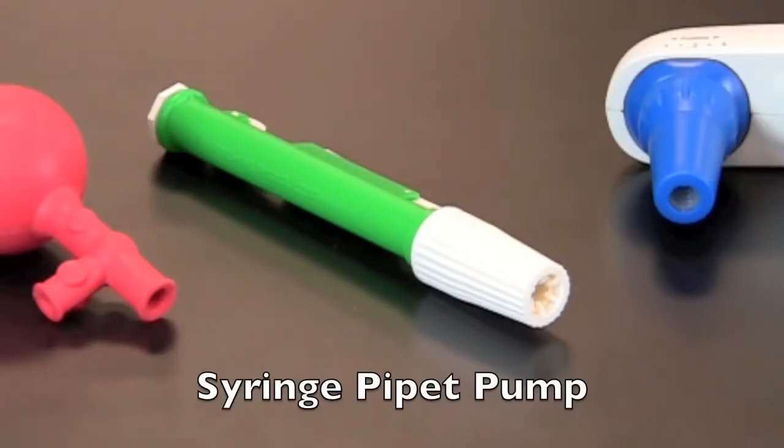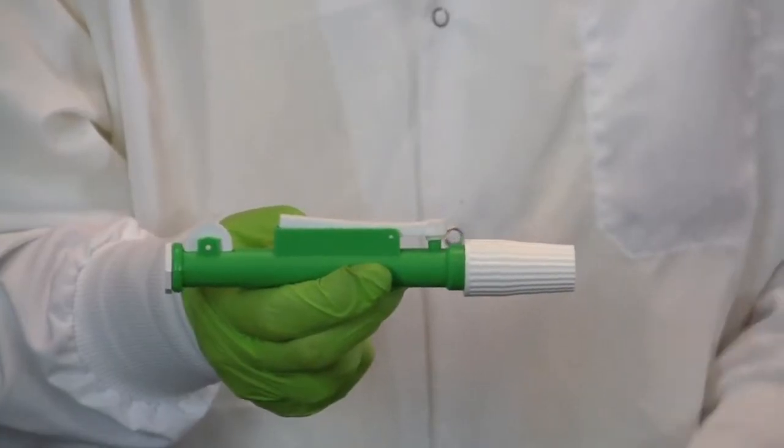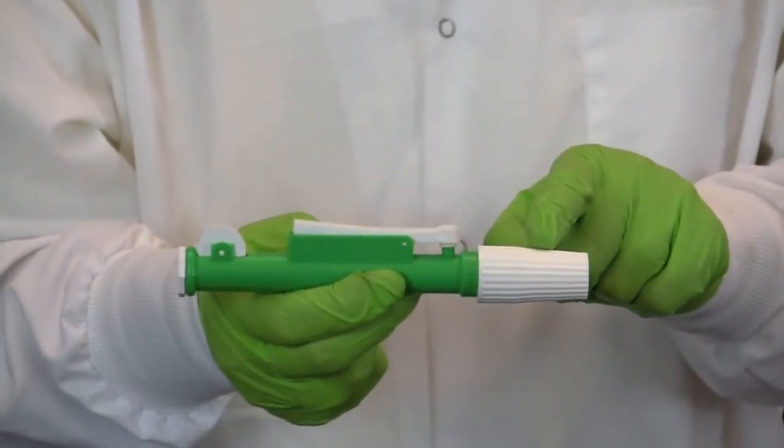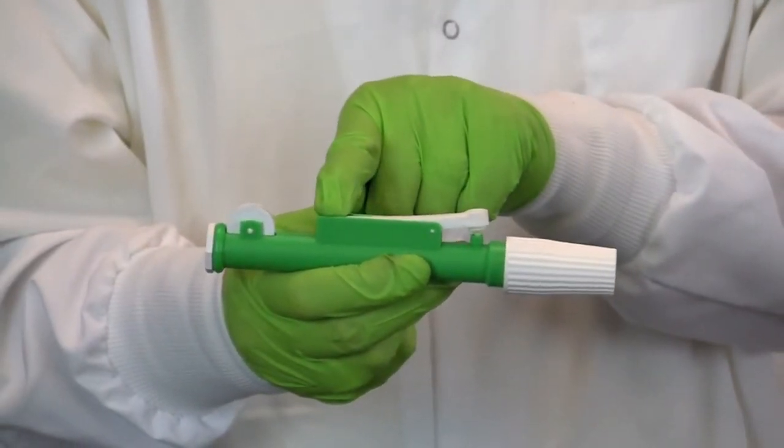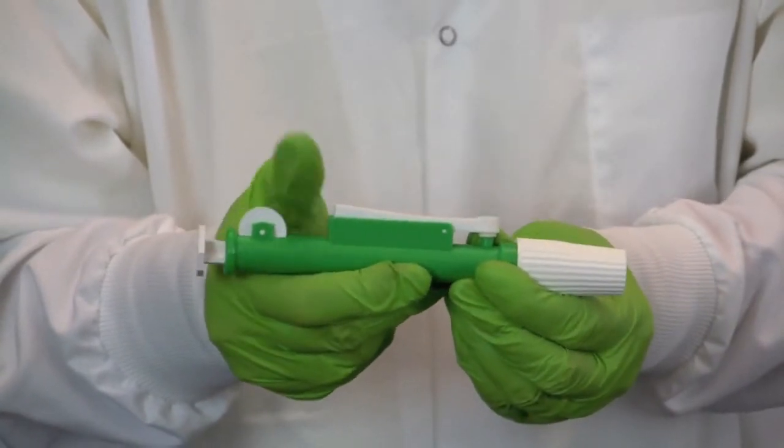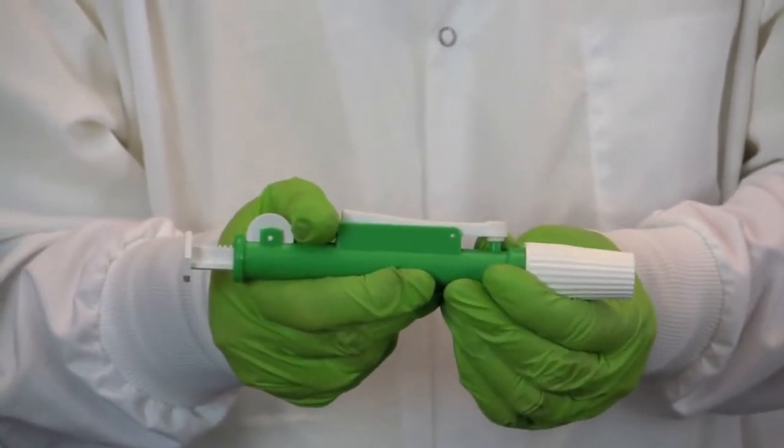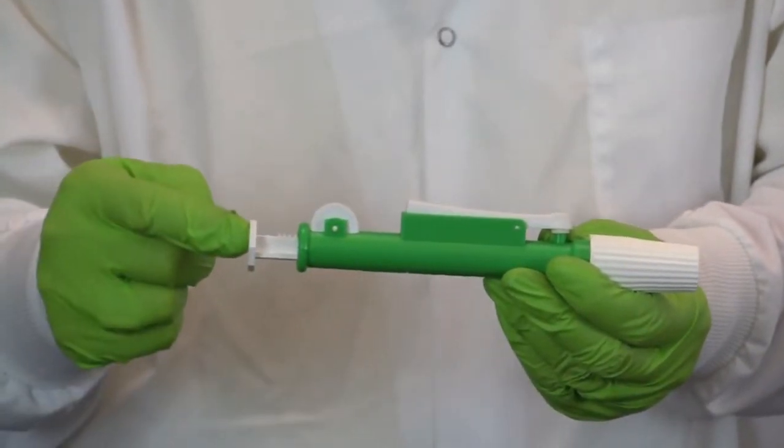This is a syringe style pipette pump. The parts of this pump include a gasket that attaches to the pipette, an exhaust valve which is used to expel the solution, a dial which is used to adjust the amount of solution transferred, and the plunger which is used to blow out any remaining solution.